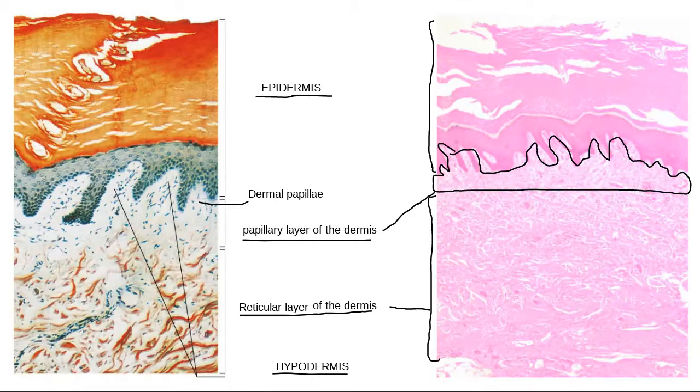More specifically, when we are inside the epidermis region, there are actually some specific layers in it that we also need to be able to identify.